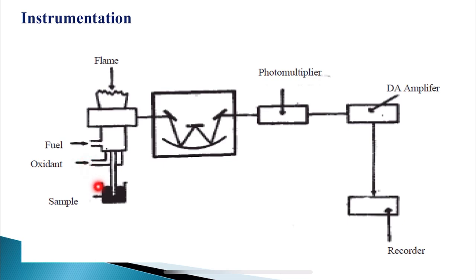In the same way, the graph has to be plotted. If I do not maintain a constant thermal environment inside this pressure regulator chamber, I will definitely see irregularity in the results I am going to get.